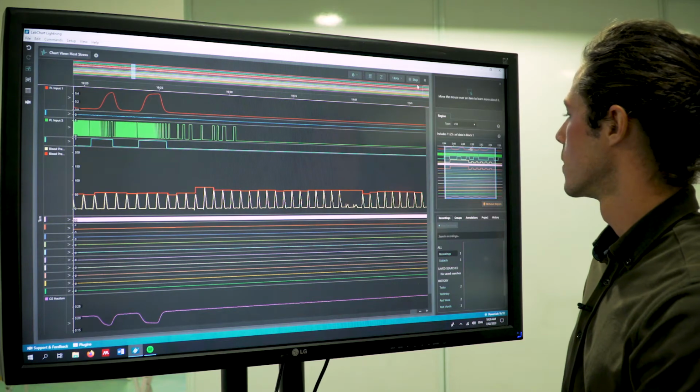For someone who's not good at coding or even software in general, I think it's been quite helpful. It's very intuitive, just copying and pasting and dragging. So it's really handy for people who aren't so technologically efficient.